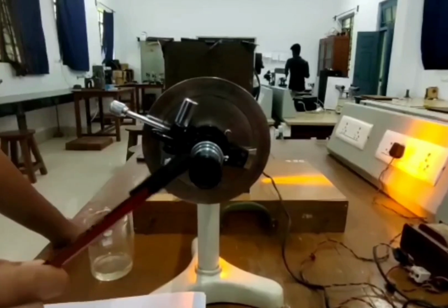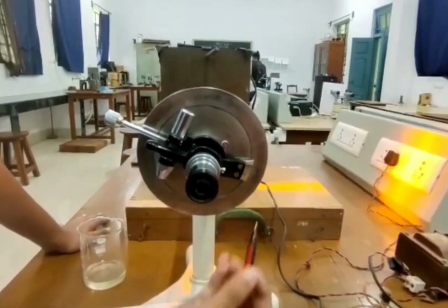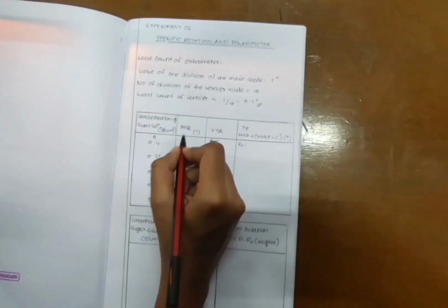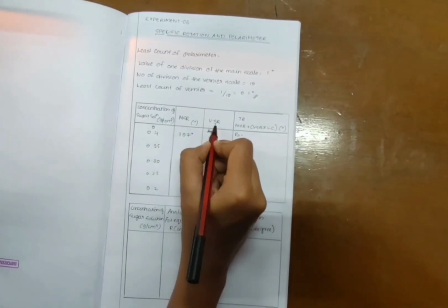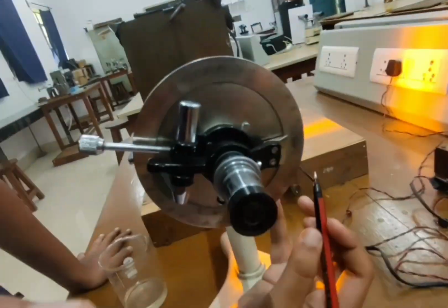Now, after viewing full shade, we are observing the main scale value. Here, the main scale value is 107 degrees. So, the main scale reading will be 107. Coming to the VSD reading, here it is 2.